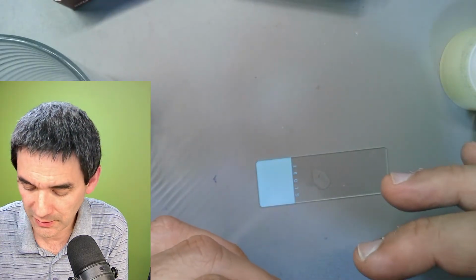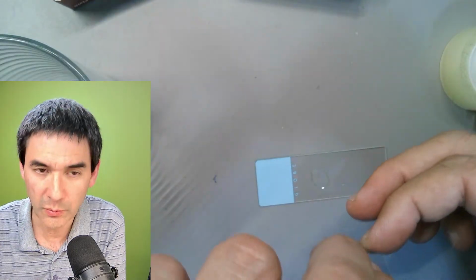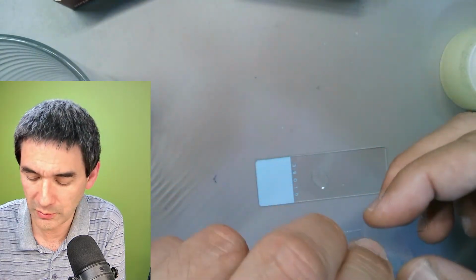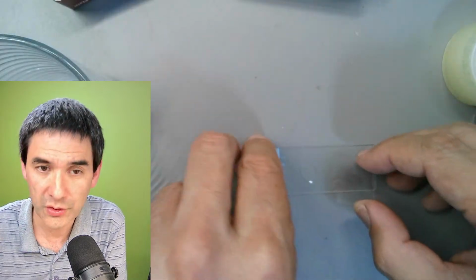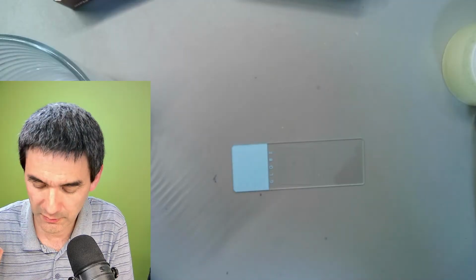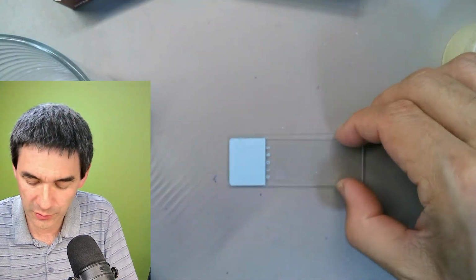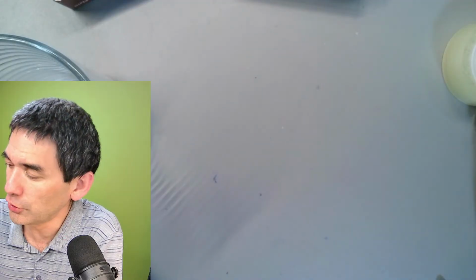Is there only one of them? Okay, there's only one. So I'm just going to drop it on here. Everything's going to spread a little bit, and I hope that it's not going to completely crush them. And now I have the challenge of finding them again.